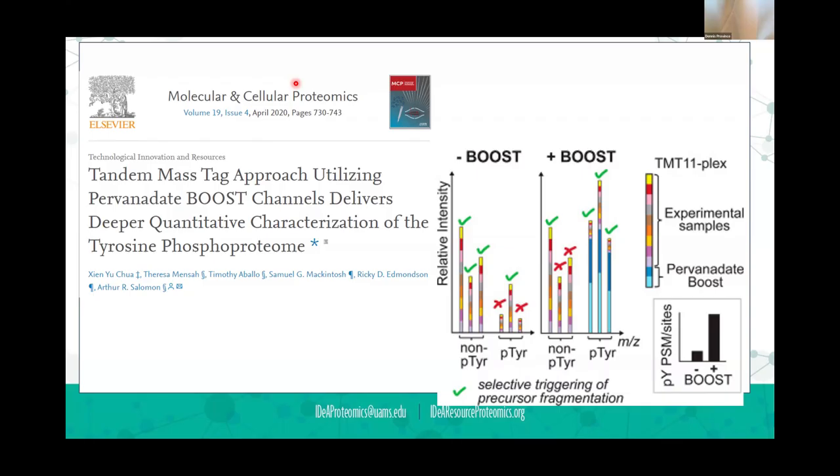And so they did a publication where they did a comparison. The advantage is with this super binder domain, you can grow it up in your lab, and it's for pennies on the dollar. Do this pull down. And so they had the ability to enrich these peptides. We were doing some TMT analysis of phosphotyrosine, and the levels are just so low, right?